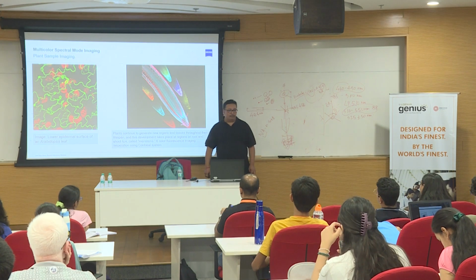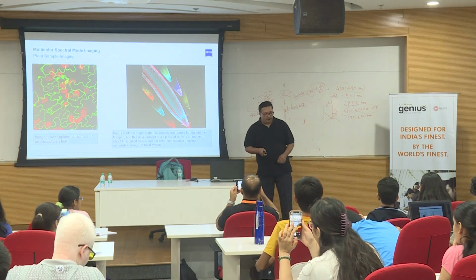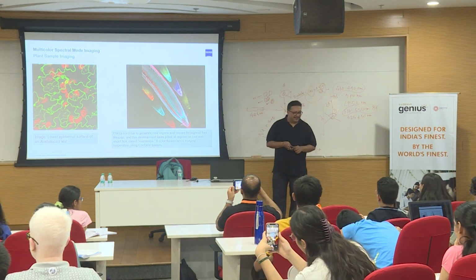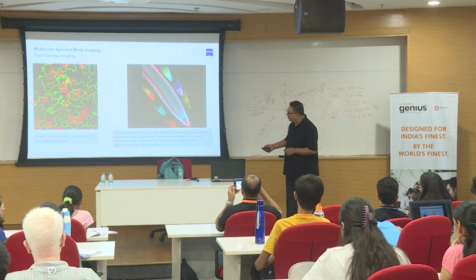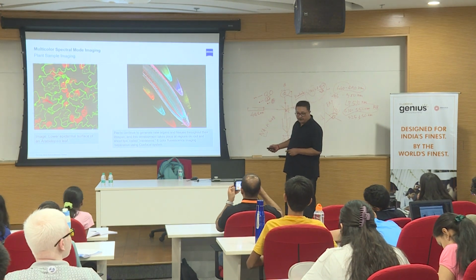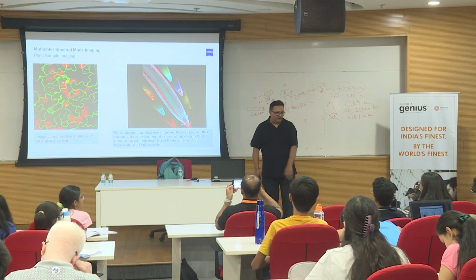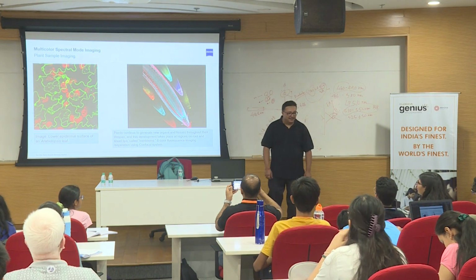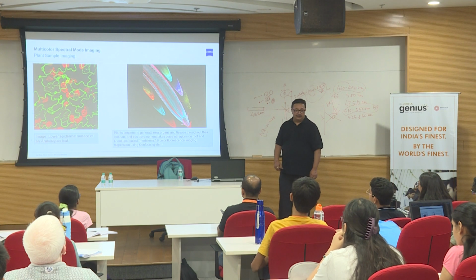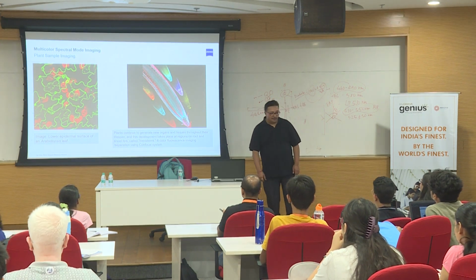You see the fascinating world of plant samples. Anybody understanding bio, botany, plants? Okay. What type of plants? Arabidopsis. You understand Arabidopsis? Okay. This is nothing but an Arabidopsis leaf, and you can see what are these structures? Any idea? At least I don't have an idea because I am not from the bio background. What are these? Stomata. Very nice. And you see some red, some green.